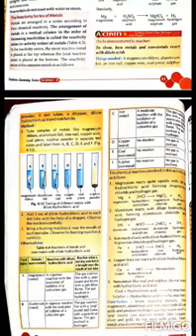So, no gas is evolved in test tube D. Coming to test tube E, in which coal is placed, again we see no reaction and no gas evolution. Same is followed in test tube F, in which sulfur is placed. Again, no reaction and no gas is evolved.